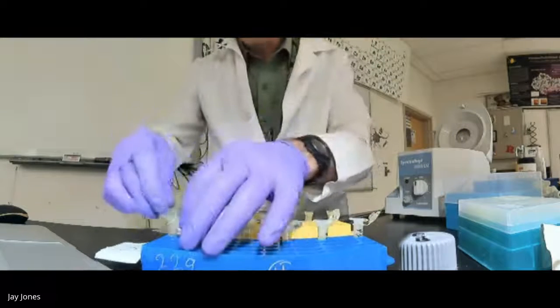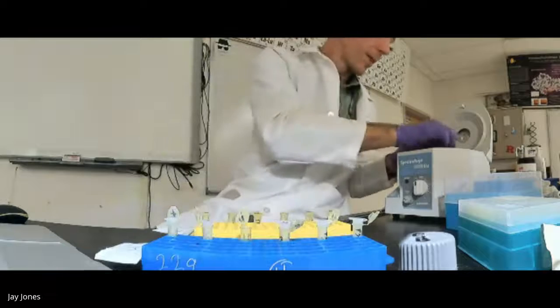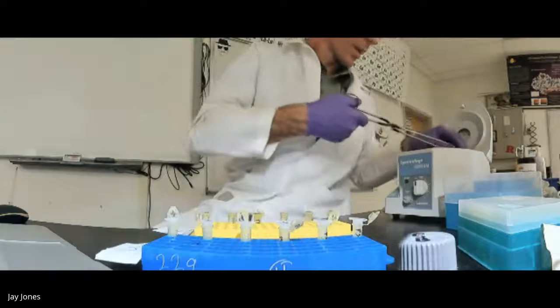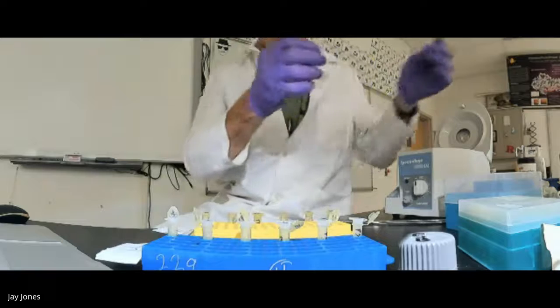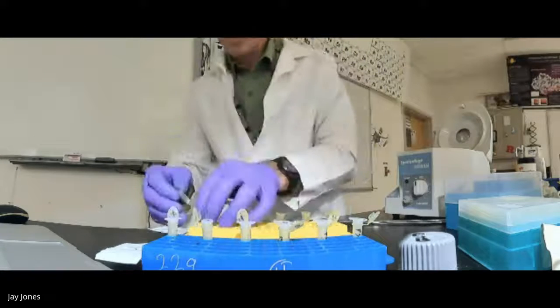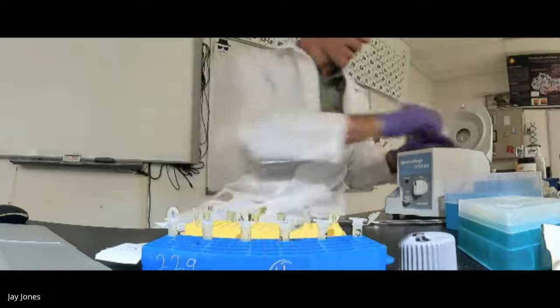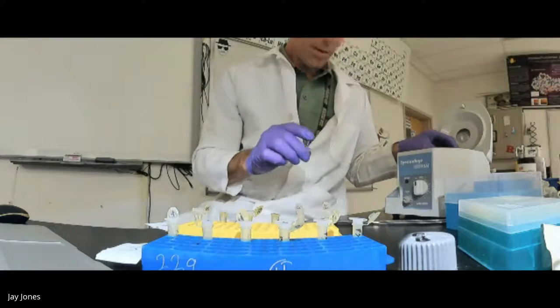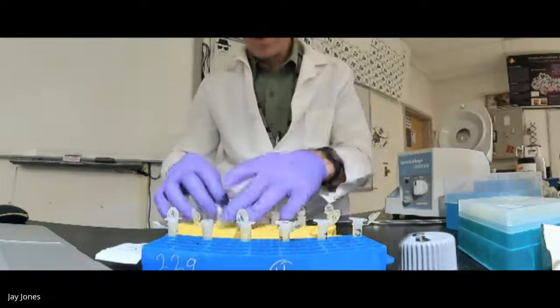P3 T1 goes in 7. I'm gonna open up the 8 and 9. P3 T2 goes in 8. And P3 T3 goes in 9. To get these old collection tubes out. We do the same for period 12. All right, this is period 12, table 3. That's going to go here. Period 12, table 1. That's going to go in 21. Period 12, table 5. Goes in 25. Period 12, table 6, goes in 26. Period 12, table 4, goes in 24. And period 12, table 2, goes in 22. Because those are the numbers in the box.